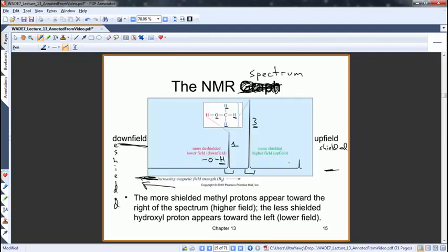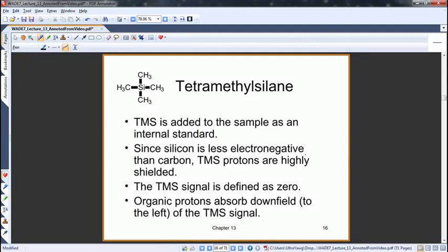Okay, if you notice in our spectrum here, we have this guy. I'm sure a lot of you were like, what is that, Jay? Please tell us. Well, don't worry. Here's what it is. Because HNMR spectroscopy has been around for a while, lots of people have been doing these experiments with lots of different types of instruments, with varying degrees of resolution and quality. And so we as chemists need a way to say, okay, I did this experiment in 1980 on a computer that was using a card reader. How do I compare my results to a computer from 2015 that cost $1 million?